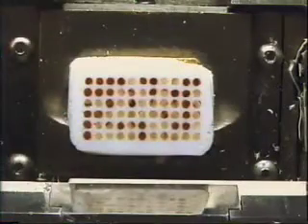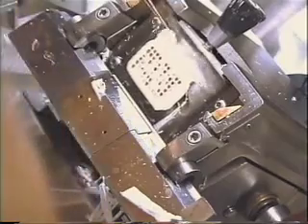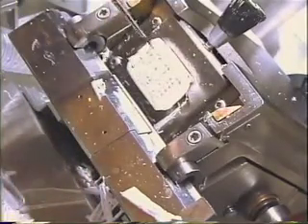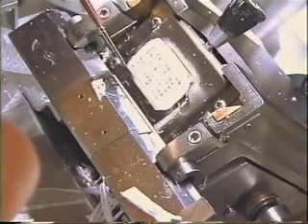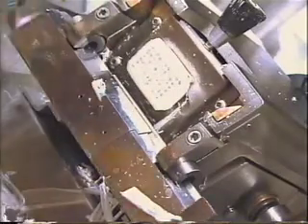Trim some of the melted OCT away so the array block will clear the blade when cutting. Section the array block as you would any frozen tissue. During trimming, you may find it necessary to melt the array block again to set the punches. This is common practice and you will have to melt and set the punches several times as you go deeper into the array block.